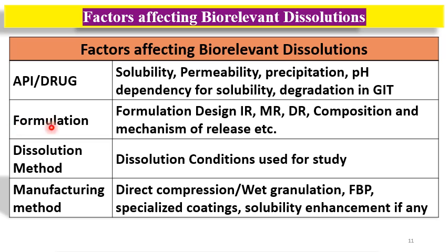Then formulation design, that may be immediate release, modified release, delayed release, composition and the mechanism of release. These are the important parameters of formulation which have great impact on biorelevant dissolutions. Then dissolution method, dissolution conditions used for study. These have a great impact.